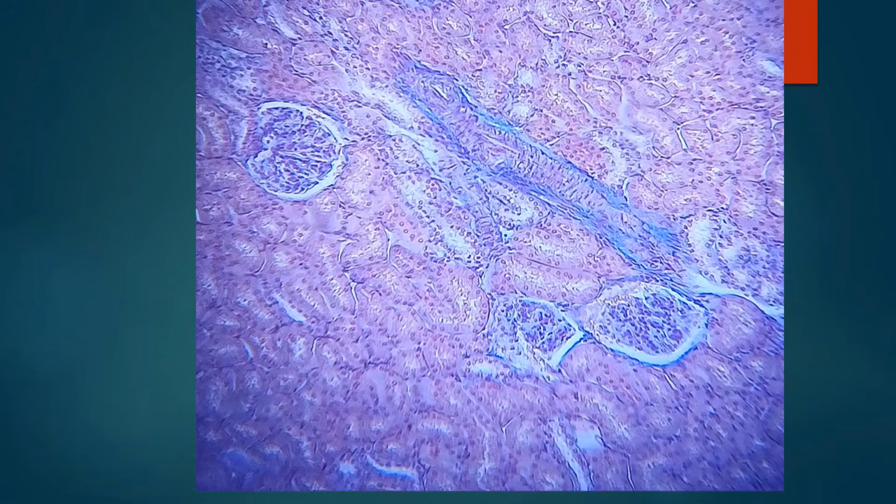The same slide at further higher magnification. Here you can see the renal corpuscle. This area, the white colored area, is the Bowman capsule. Here in this location you can see the macula densa which is present. These are the sections of the proximal convoluted tubule.